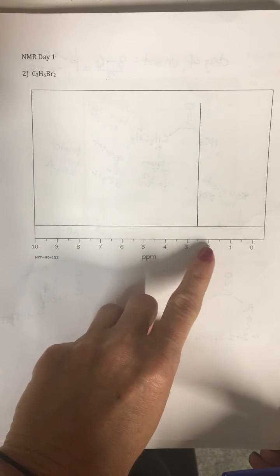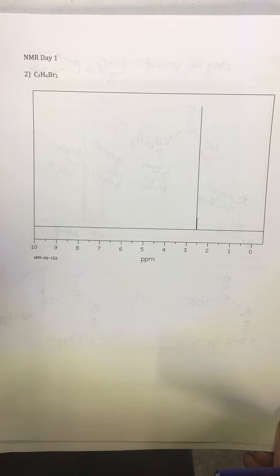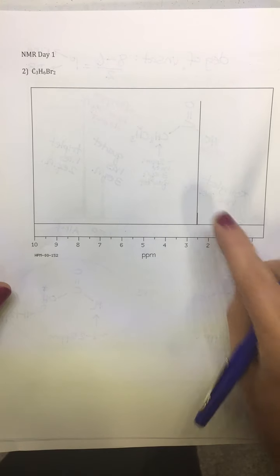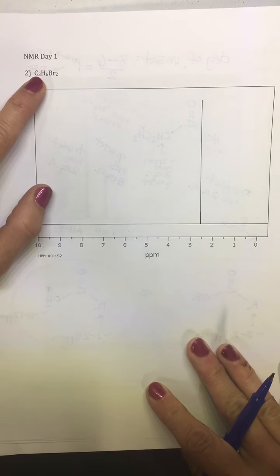Bromine is not very electronegative, so a little bit more upfield. If you had hydrogens that were closer to fluorine, you'd probably be closer down here around 4.5 parts per million. But one signal, okay? So starting with our degrees of unsaturation, just like we did before, we have 3 carbons.